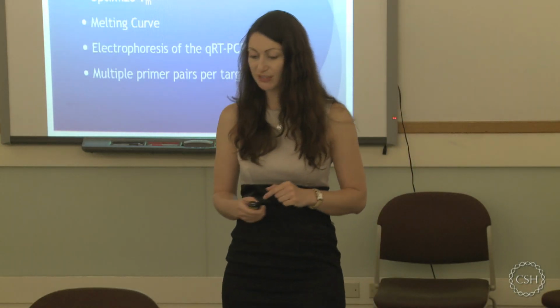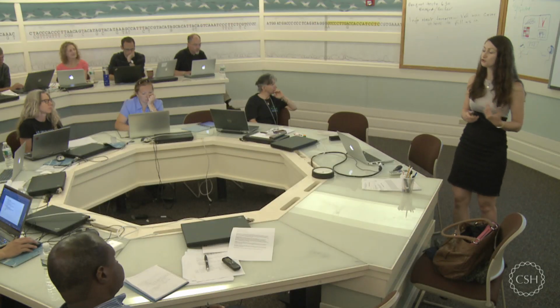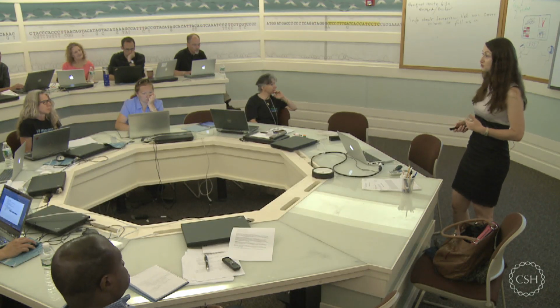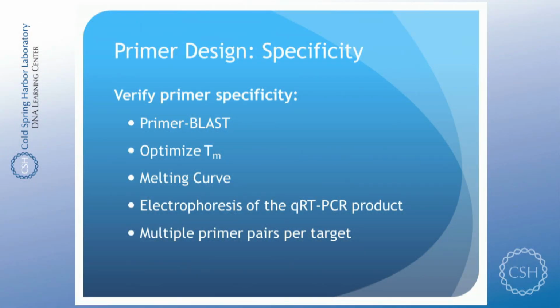Now about primer specificity, even if you do not design your primers with PrimerBlast, it is very beneficial if you afterwards use PrimerBlast or just a basic blast search to verify my primers are actually specific to my target and they don't accidentally bind to 100 other transcripts. You will see that sooner or later, but maybe you want to know that before you order the primers and do the whole reaction.